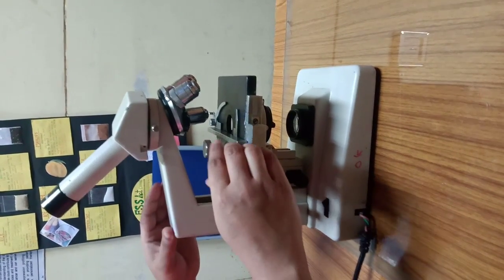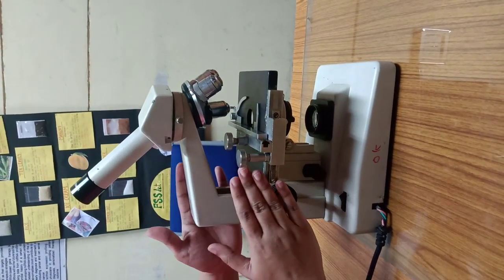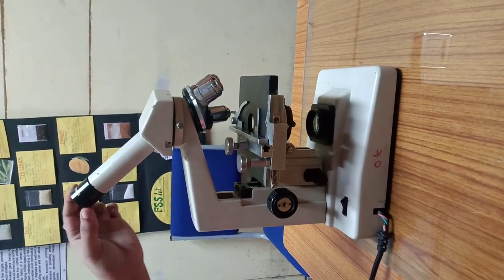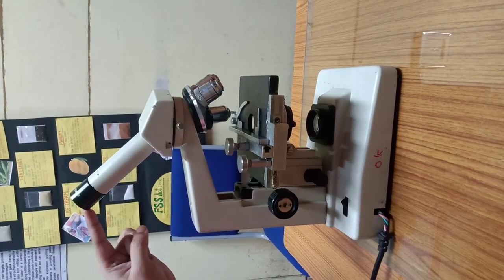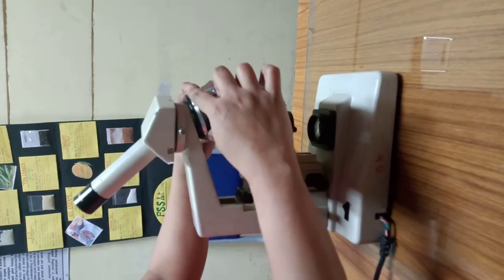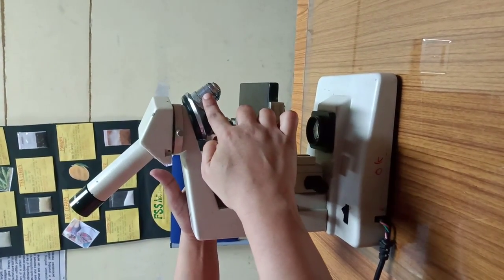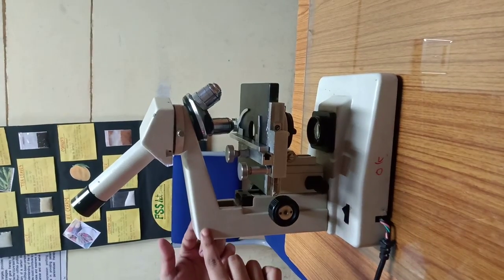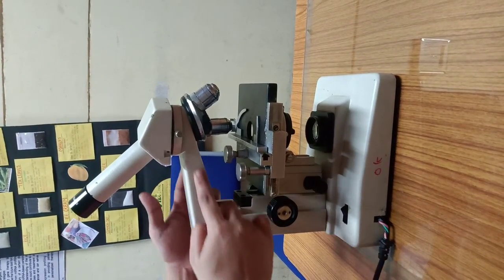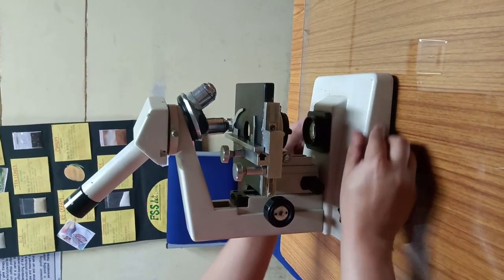Okay. I repeat, and I go back from the top and I will come down with the parts. Remember, I spoke about the ocular lens, the eyepiece, the body tube, then here the revolving nose piece, objective lenses. This is your neck, and this is your handle, and this is your base.